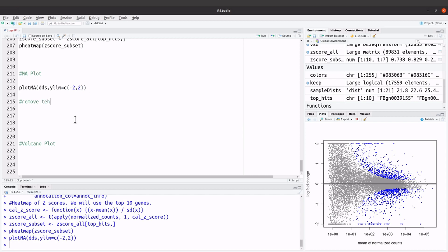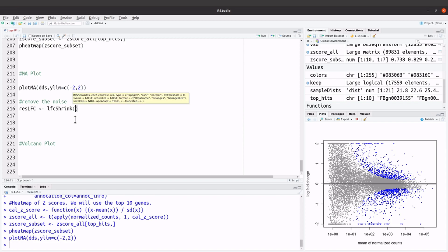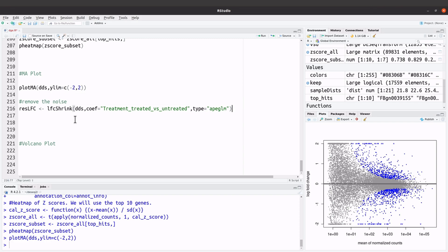We will use the log2 fold change shrinkage. To do that, we say resLFC and then lfcShrink, specifying our DESeq2 object and our coef. The coef is going to be treatment_treated_vs_untreated, and then we indicate the type, which is apeglm. Let's execute this command.